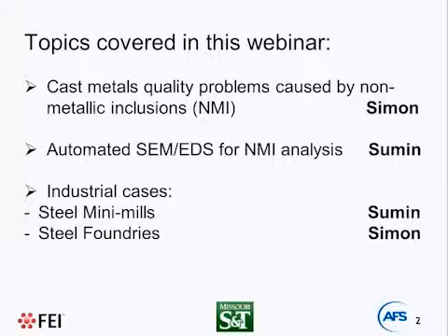But at the start of this webinar, I would like to say to the steel foundry community that this tool is not only for academia or research organizations. In the last decade, this method became a routine tool for day-to-day operation in steel mills, and Sumin will show you many practical examples. Yes, automated SEM-EDS analysis is not used in foundry practice yet. However, I will show you today how this powerful tool can be used for steel casting production. Our webinar will consist of several parts, and we will share our presentation.